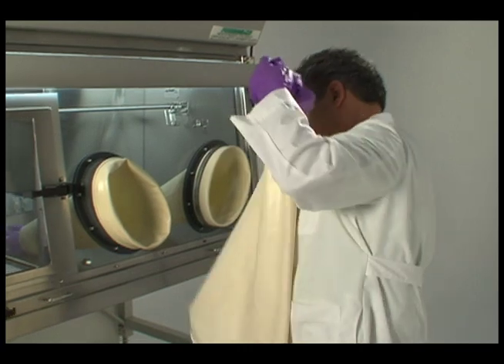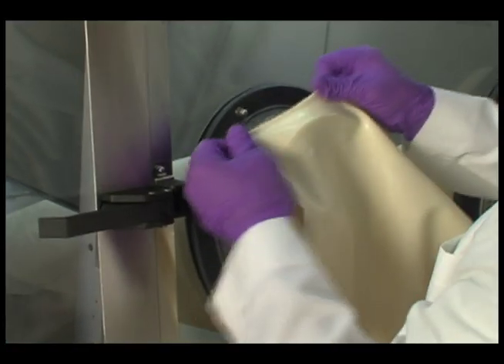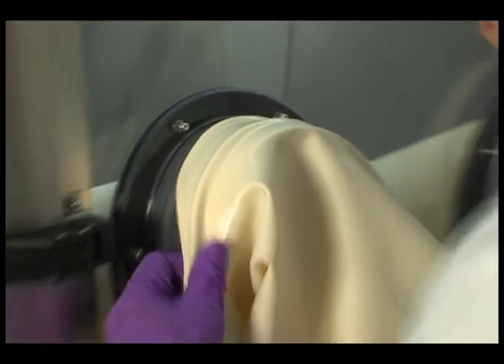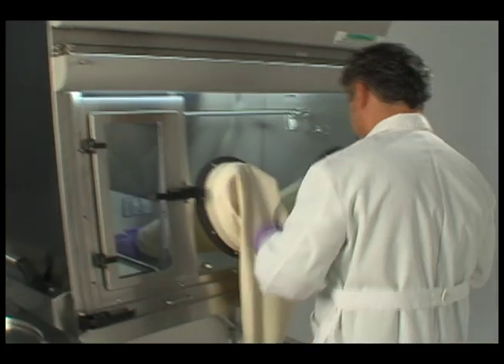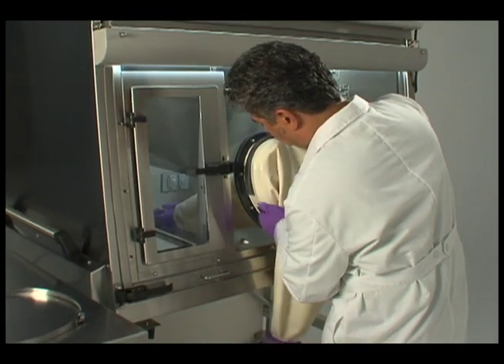Place a new sleeve over the old one so the new sleeve cord is seated in the second groove. Replace the stainless steel band clamp and sleeve protector.